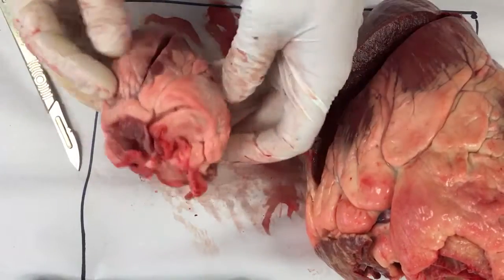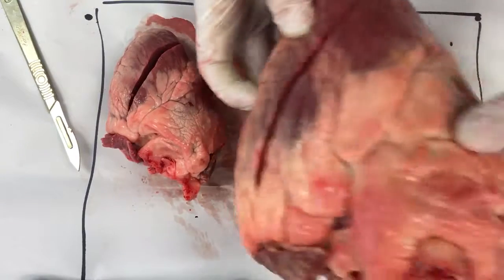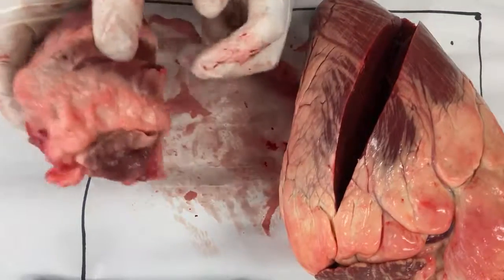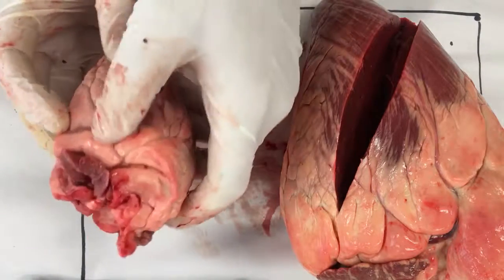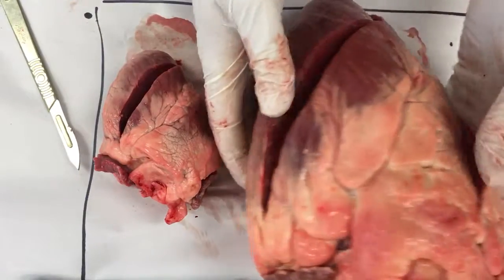We have two hearts here — a lamb heart and a cow heart. You can see this one weighs about four kilos roughly. In our practice what we've done is cut into here, basically straight through this fleshy part and straight through this fleshy part. I've done the same, exactly the same on the cow.